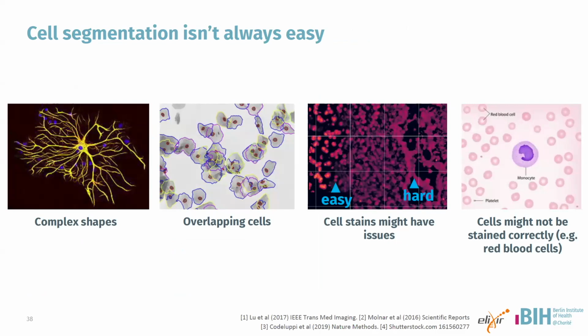So this is my last slide on cell segmentation. I actually didn't want to talk about cell segmentation. I want to talk about cell segmentation-free methods. When we started going into this, analyzing our first data set, which was published from the group of Sten Linnarsson and colleagues, we started looking into the shapes of these cells that we were trying to segment. And this is an astrocyte. It's a very common cell type in the brain.